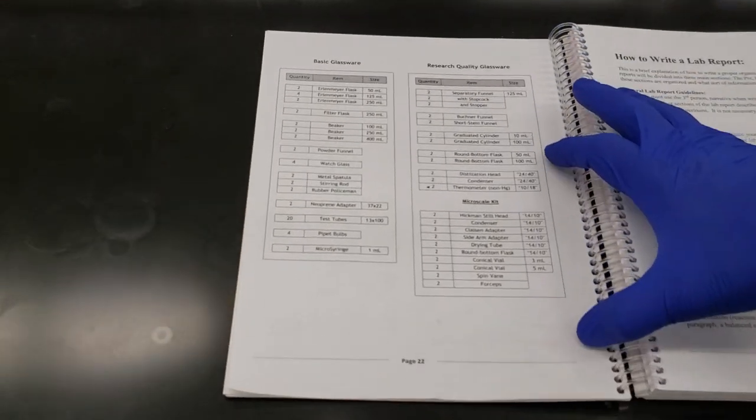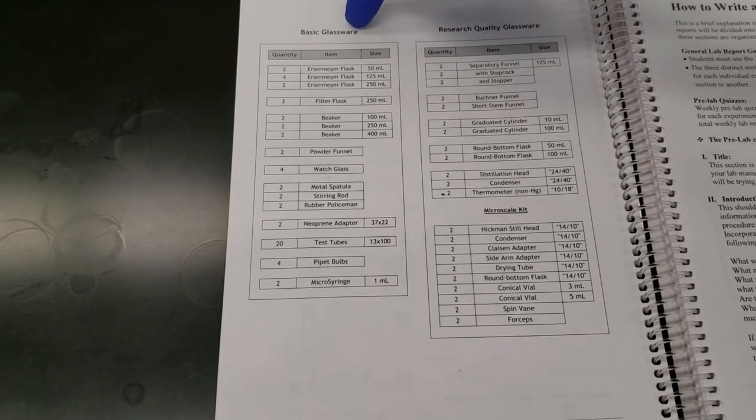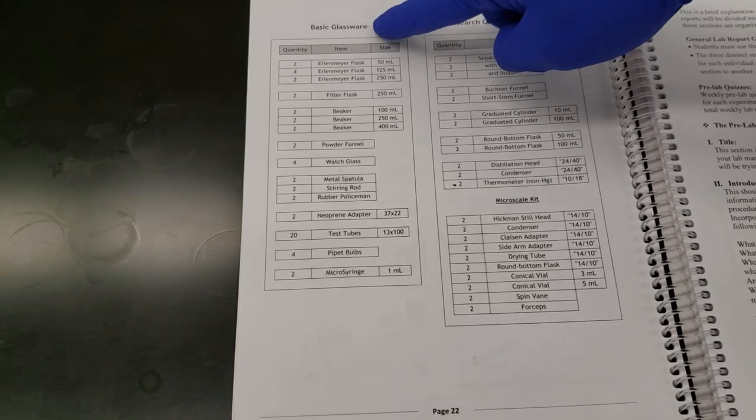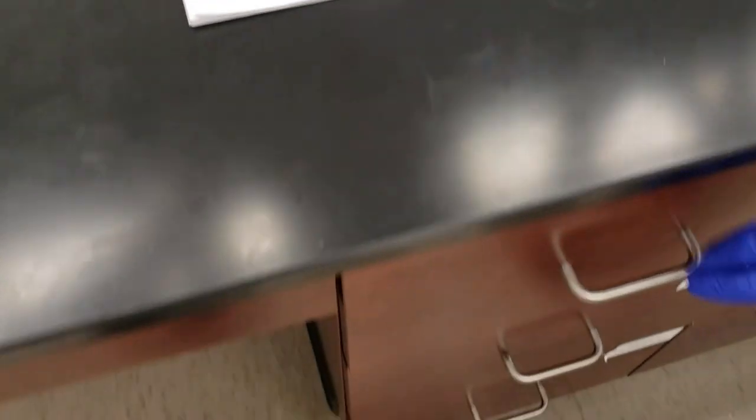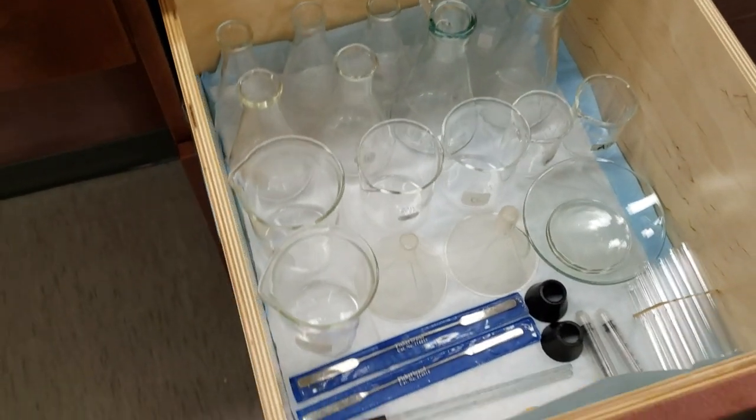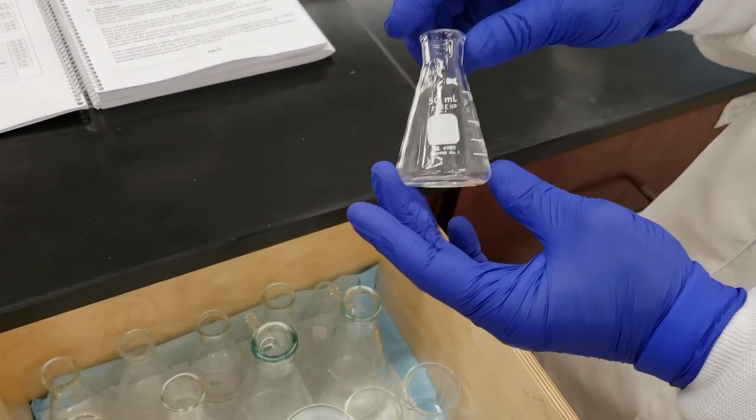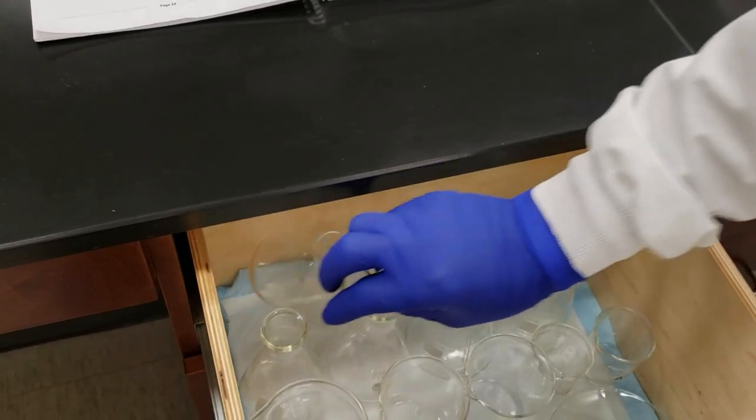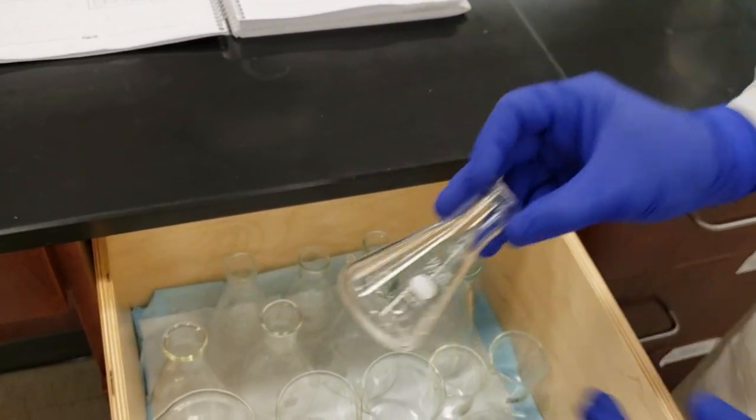If we open our lab manual, we'll find a list of all the glassware present in our drawers. Starting at the top, we have two 50 mL Erlenmeyer flasks, four 125 mL Erlenmeyer flasks, and two 250 mL Erlenmeyer flasks.